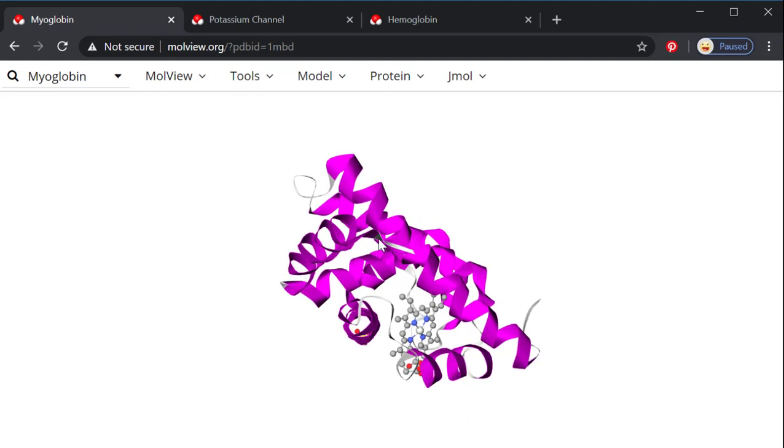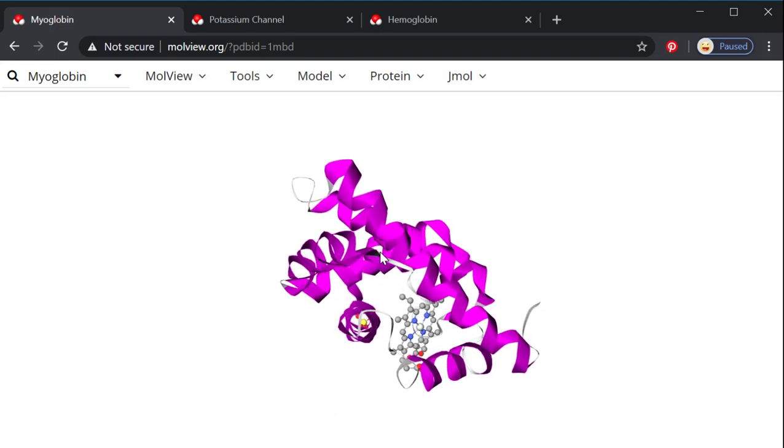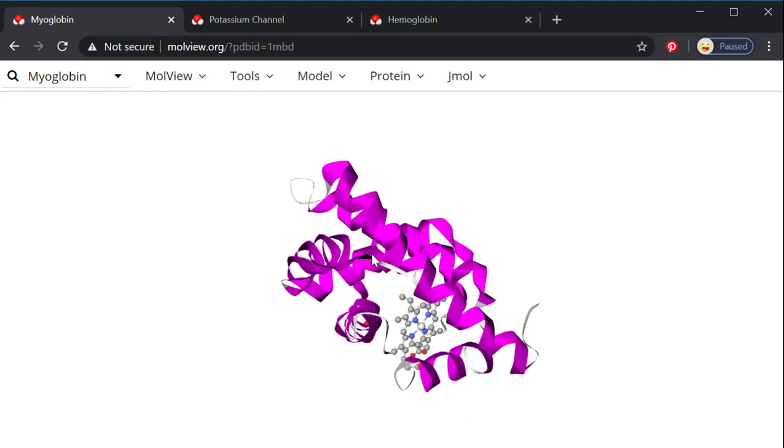So a few different ways you can play with this to look at it besides rotating. Remember the blues are nitrogen, the grays would be carbon. This would be an iron here in the middle, red is oxygen.